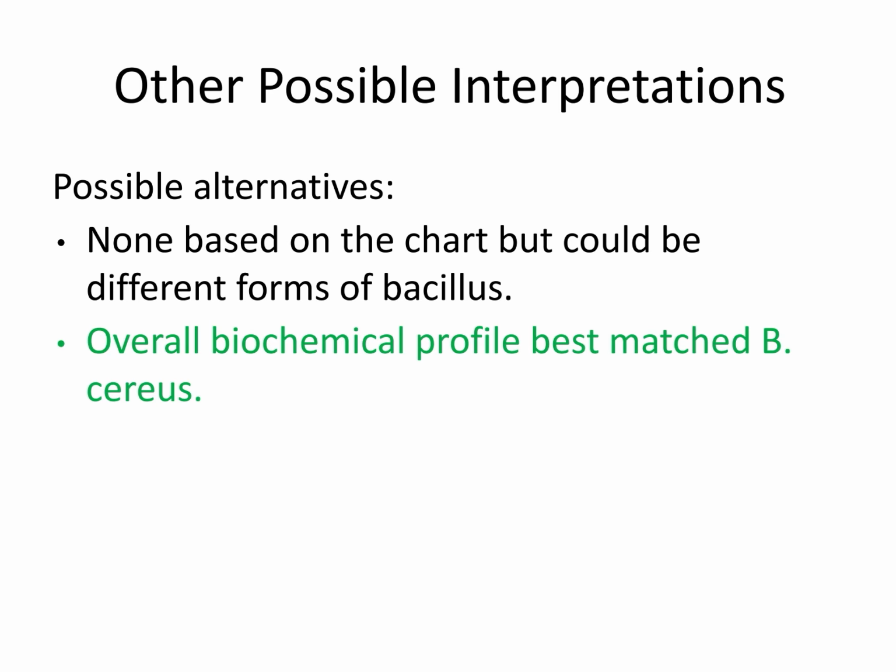Other possible interpretations: overall, with the chart that we were provided, it wouldn't be any of the other things listed. However, it could be a different form of Bacillus, and there might be further testing that could tell us whether or not that were true, but for our lab experiment, Bacillus cereus was the only one that was coming up with all the tests that I had results for.